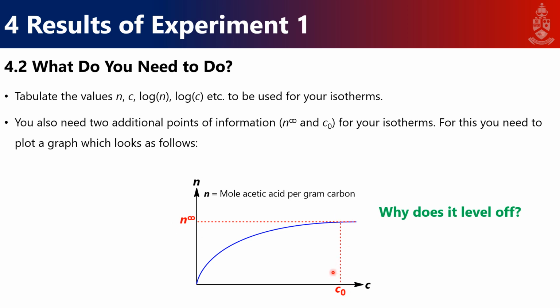And that corresponds to some sort of maximum concentration, and you can read that off from this plot. Your curve might not look perfectly as this would, so you essentially just do your best to get these two values, wherever they may be. You take them as is, and you work with them further on in the next part of your report. All right.